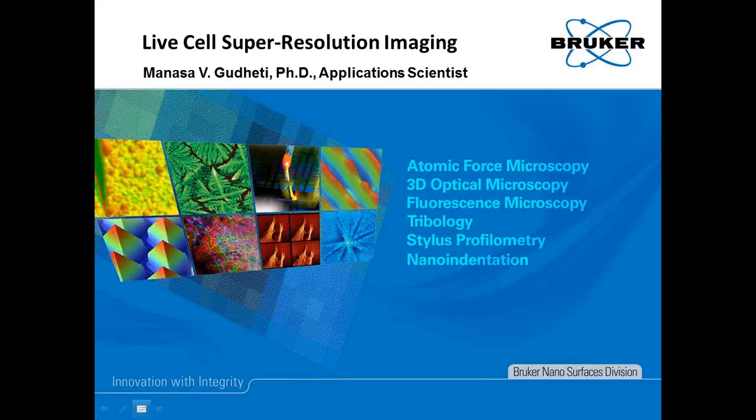Thank you for the introduction, and good morning. Welcome, everyone. Today I want to give you a brief overview of the advancements in live cell super resolution imaging, specifically in the single molecule field. This is an area that is rapidly evolving, and compared to doing fixed cell imaging, there are a lot more factors to take into consideration. I want to go through each one of them and give you examples of how to optimize those factors so that you can get the best super resolution images possible and thus drive your science forward.